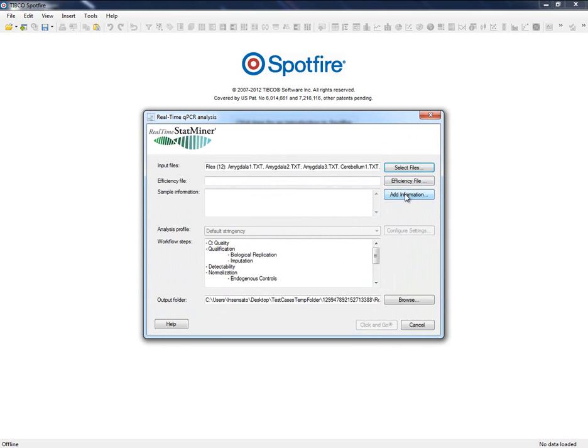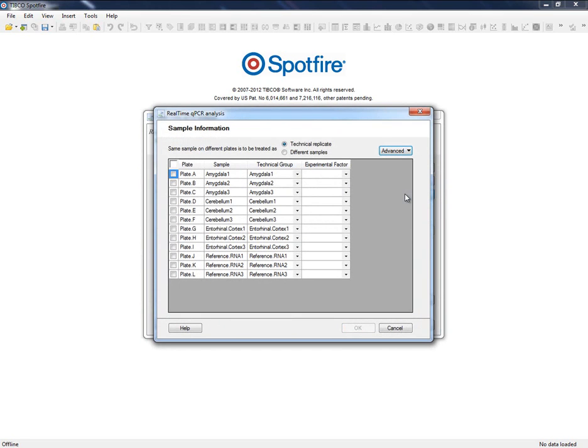As we can see, our example consists of three tissues plus a control group, and each tissue has been replicated three times.